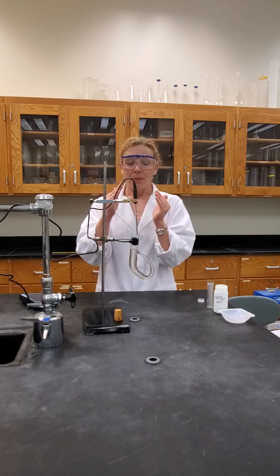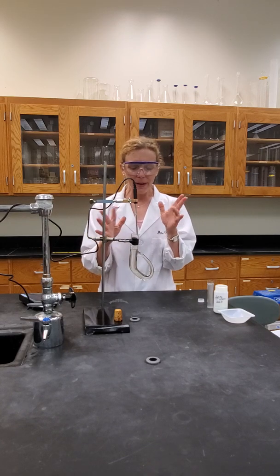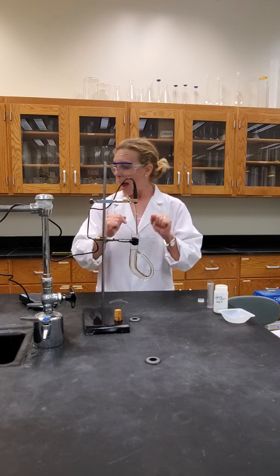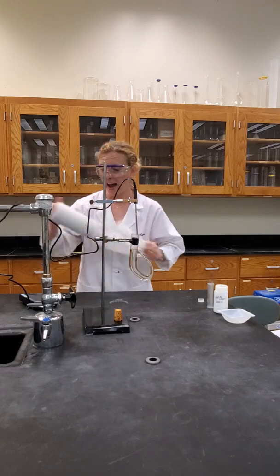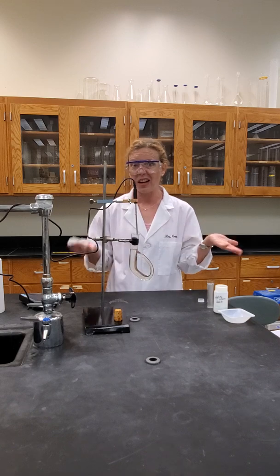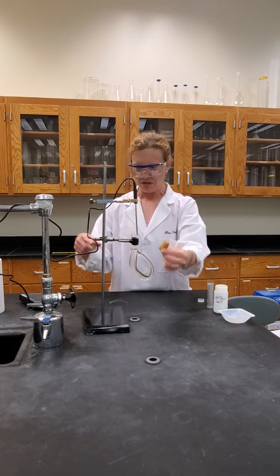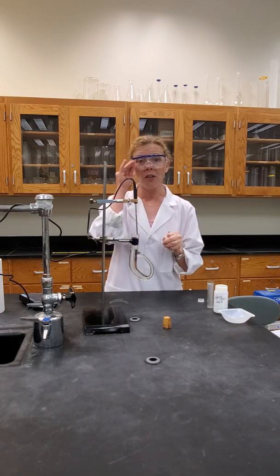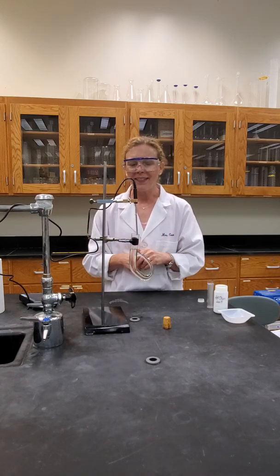Cleanup. Now, mineral oil, non-polar, so it's going to be a little finicky, and we can't just clean it up with water or just by wiping it down. We definitely need to get a piece of paper towel, and I will have a bin of soapy water already ready for us because I know that we're going to have to clean up. Wherever you set your cork may get some mineral oil places. So if you want to get a small beaker of the soapy water that I have available, of course, make your own, but I'll have it all ready for us.